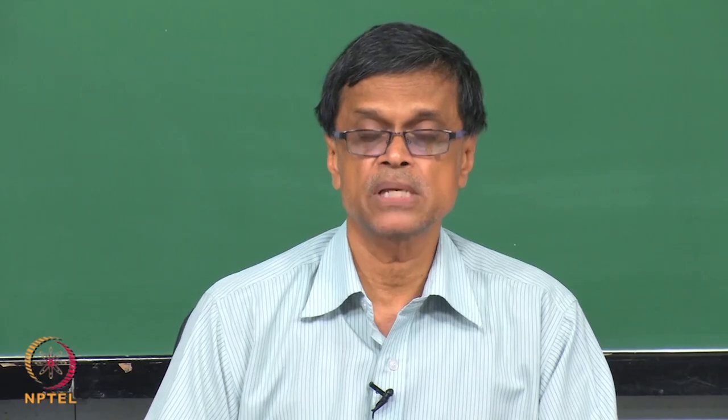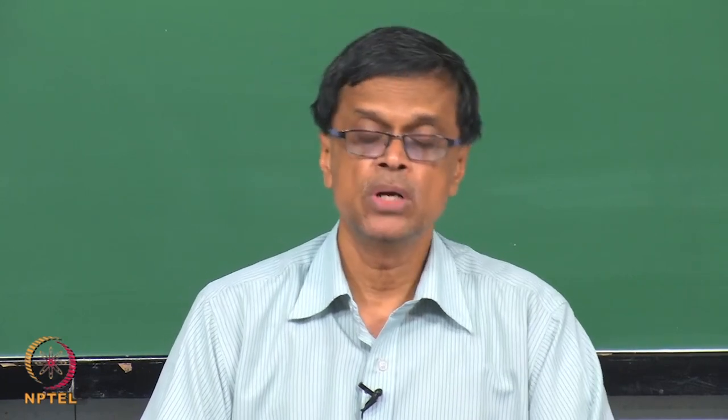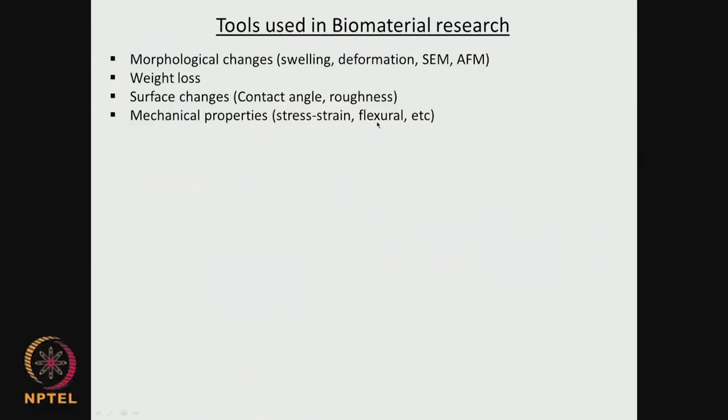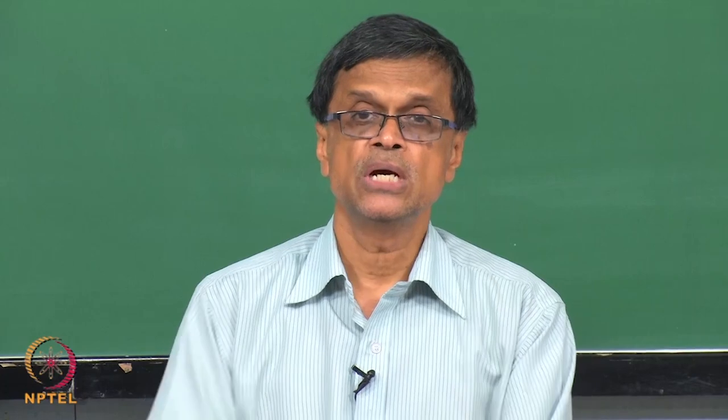Next comes changes in mechanical properties. If you are using materials especially in the bone or in the knee, where there is load bearing, I would like to know the stress-strain changes. Is there a change in flexural strength if you are using it as diaphragm valves and so on? So there are changes in mechanical properties you need to understand. Then comes crystallinity. Has the material become more crystalline, or has it gone from crystalline to more amorphous? Because of crystallinity changes, the degradation pattern may change, and some of the mechanical properties may change. Sometimes when the material becomes amorphous, it may even solubilize. A crystalline polymer may be insoluble, whereas when it becomes an amorphous polymer, it may become soluble. So we need to understand the crystallinity.